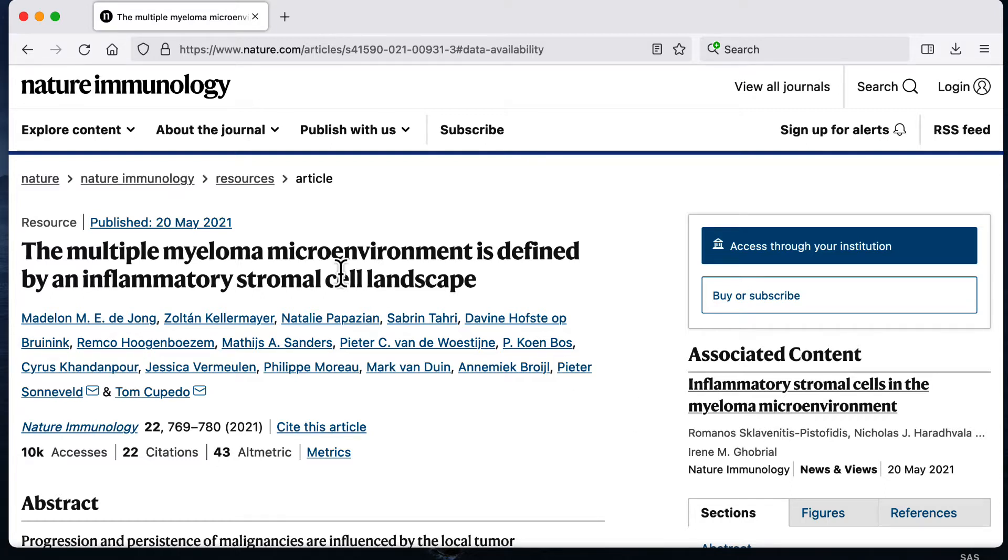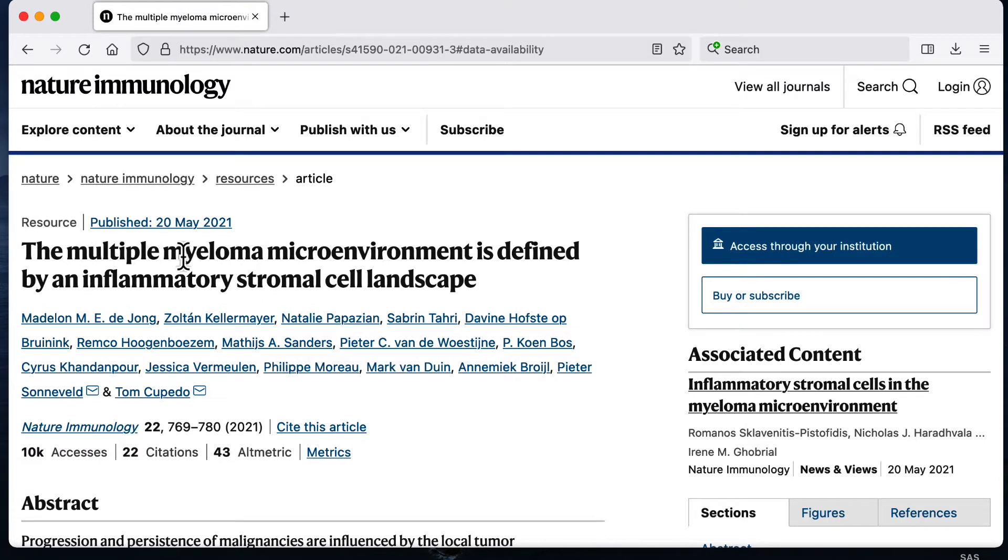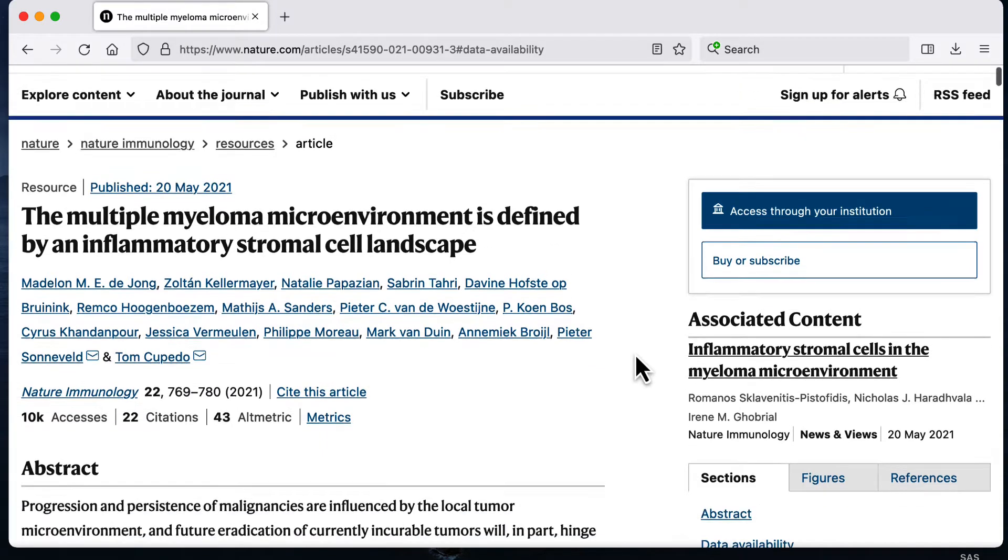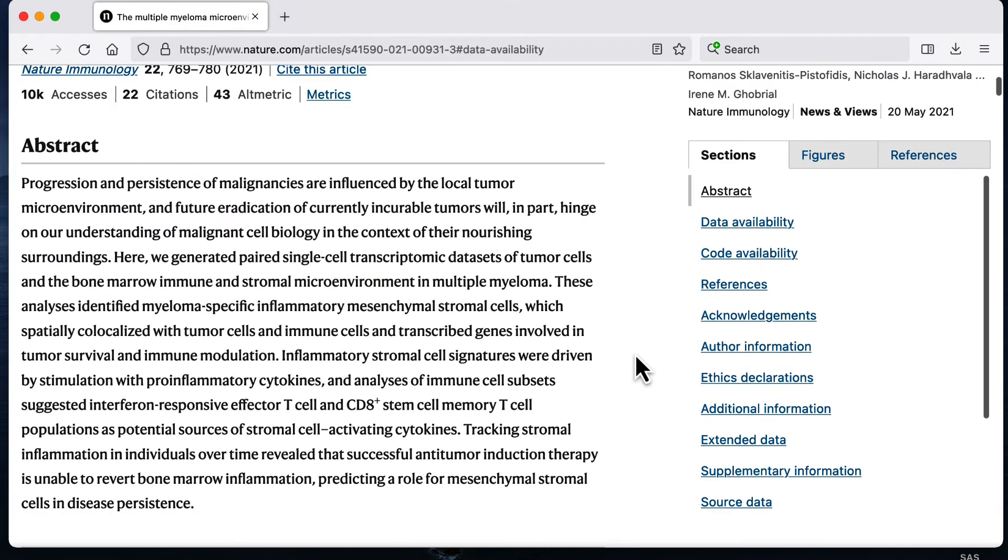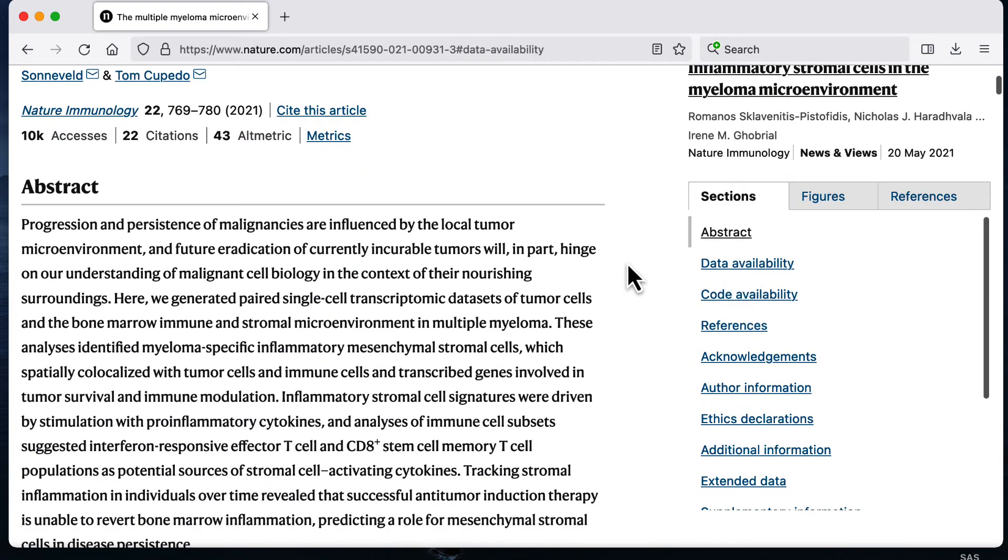For this video I'm going to download publicly available single cell RNA-seq data from this paper in a nature journal. This paper has data available for healthy controls and patients with multiple myeloma, which is a type of blood cancer. This data is available online.